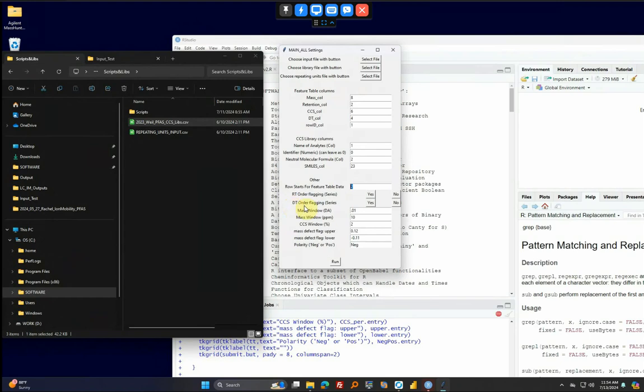They won't count as a member in the series if they don't have the right retention time or drift time order. Also, only each unique mass counts as 1 in a series. So even if you have 5 isomers for 498.9, let's say, they would still only count as 1 in the series.